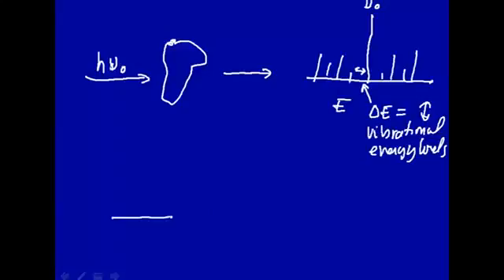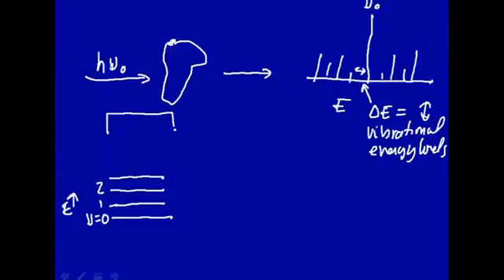Now, one way one explains that is that here you have a system, these are vibrational energy levels. This is energy going up this way. This would be the vibrational energy corresponding to quantum number 0, 1, 2, and so on. One postulates a virtual state. So the electric field of the light, remember light has a transverse electric field which oscillates this way, will oscillate the electrons in this molecule.